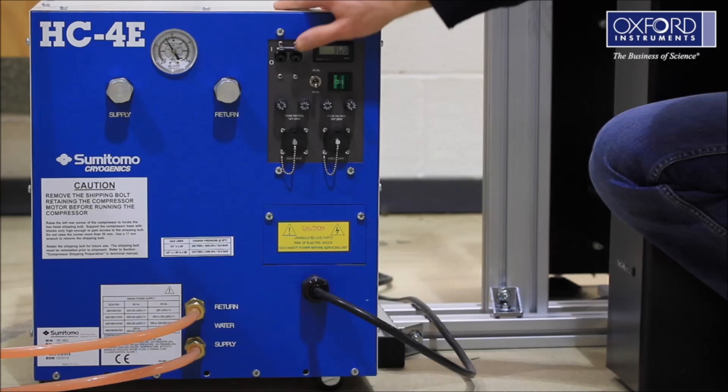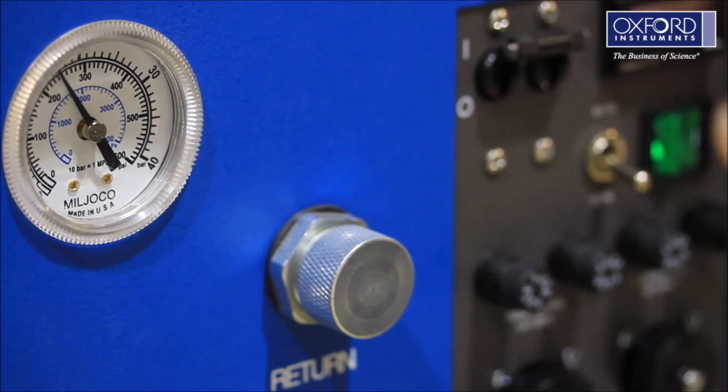Turn on the compressor before you fit the helium lines. Carry out the SHI procedure to check the operation of the compressor. Once this test is complete, unpack the helium lines and fit the labels to them.